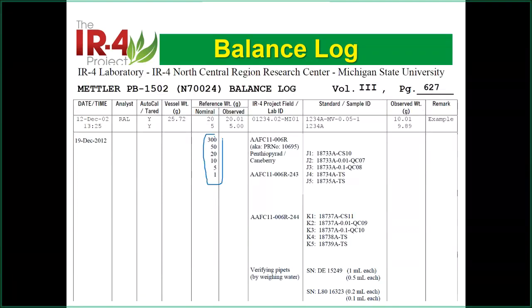This range, I know I'm going to weigh something 0.1. 1 gram should be good enough because if I weigh 10 grams, I typically verify 0.1, the lowest one. That's fine. Even this error will be like 1% error. That's fine. And this is the range.